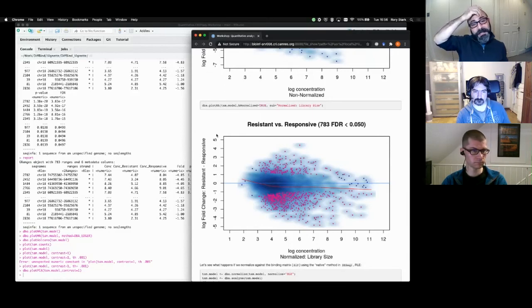It's hard to quantitate perfectly, and you don't capture the precipitation, or particularly the antibody efficiency, because there's a sonication step, and that can cause some of the bias. But the chromatin you're spiking in wasn't sonicated in the same way.